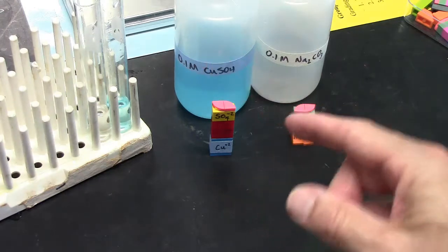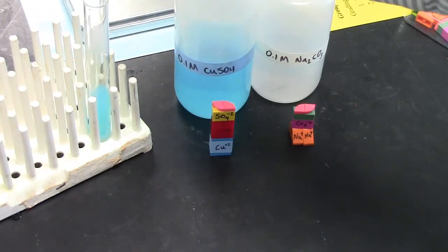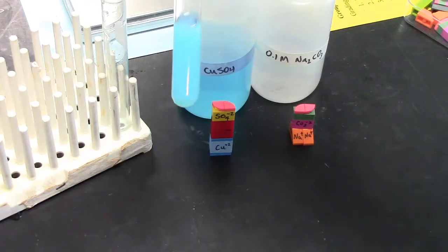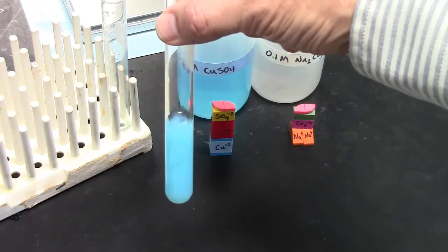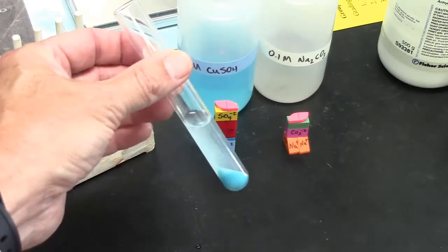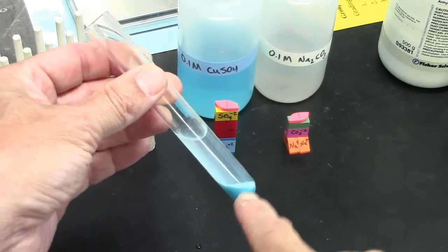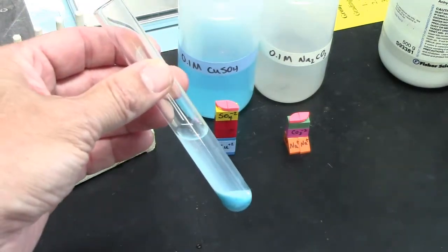The reaction, you know, is interesting. You get a nice color change and it turns all cloudy. The cloudiness indicates we have an insoluble product. After using the centrifuge, there's a pellet here of the insoluble product. There's a fairly clear layer here, which is a soluble product.